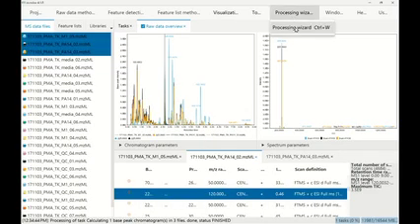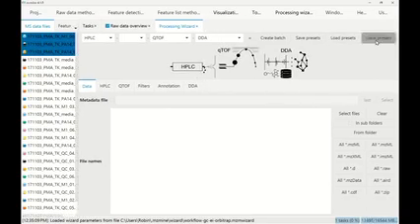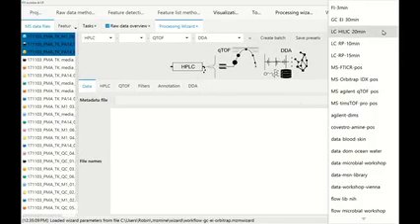Then for setting up the processing, we're going to go to the Processing Wizard, and it's here on the top. Here is really where we put together our workflows. So please open the Processing Wizard, and I already have some presets. The whole idea is that when you buy, for example, a new machine, or you develop a new method for your machine, you might be saving all the MS parameters here, and then you can plug together your reverse phase HPLC plus Orbitrap dataset. You can just plug together the settings for both instruments.